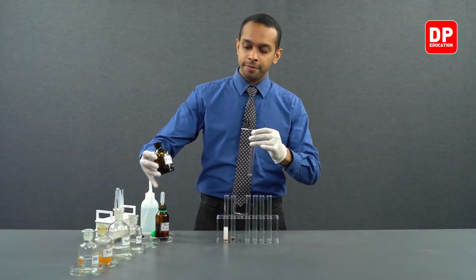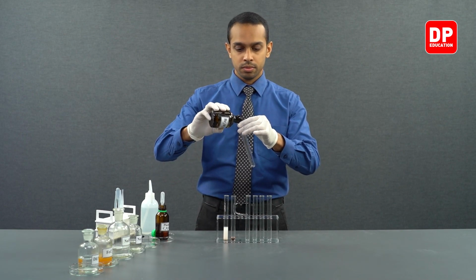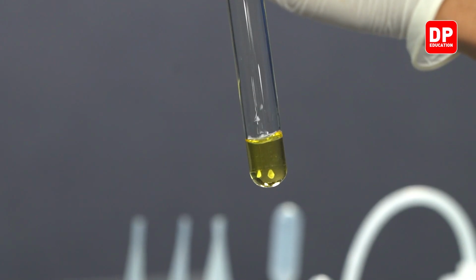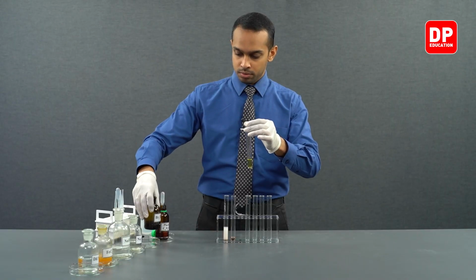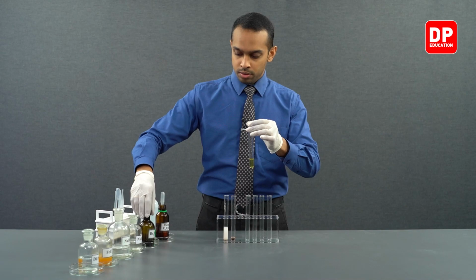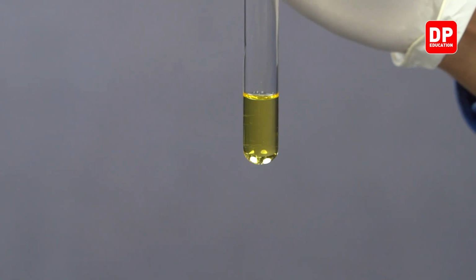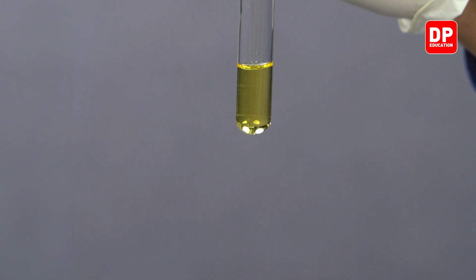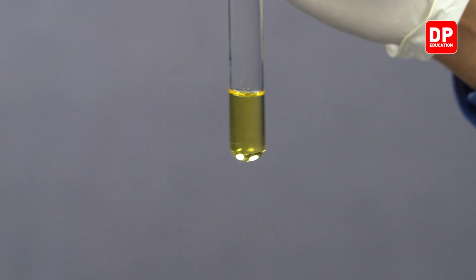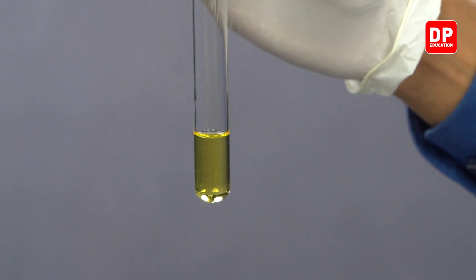Now, we have our bromine water solution. If you take liquid bromine, it will appear brown or red-brown in color. Now, this is appearing a yellow color because we have bromine water here.